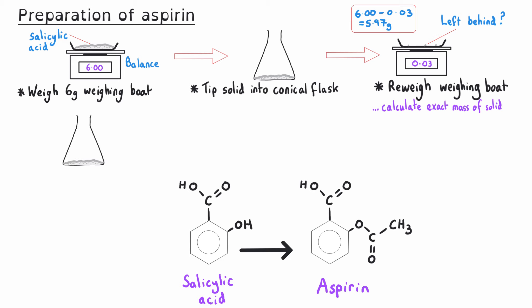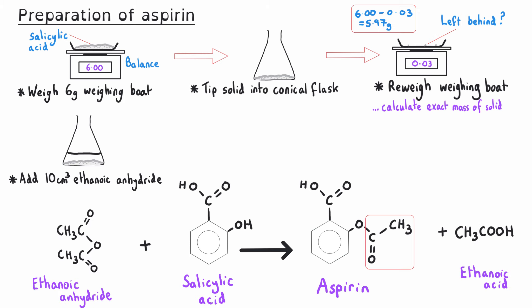Then we move on to the chemical reaction itself. We add 10 cm³ of ethanoic anhydride as our source of the acyl group for aspirin. In theory we could use ethanoyl chloride, but this would be a much more violent reaction, harder to control, and would produce toxic HCl fumes. Ethanoic anhydride doesn't react as readily, so we need to use a concentrated acid catalyst — phosphoric acid — being careful to add only about 5 drops, as it is corrosive. We could also wear gloves to protect our skin.